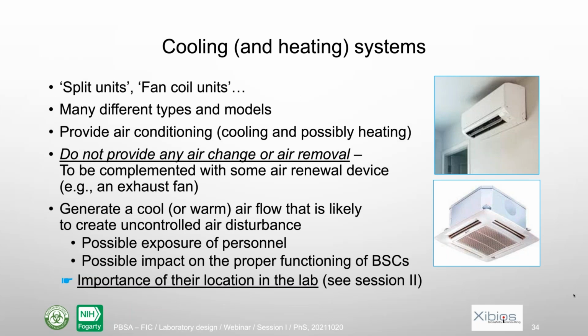Also, this kind of system, because it pushes the air, could create some exposure of the personnel who work in the lab, and it could have an impact on the proper functioning of biosafety cabinets if you have one. So it's very important to locate them very well in the lab. For instance, you should not have such a unit like the one on the wall above a bench with people working in front of the bench, because the air will be pushed through the bench toward the people. This is definitely not the best option.